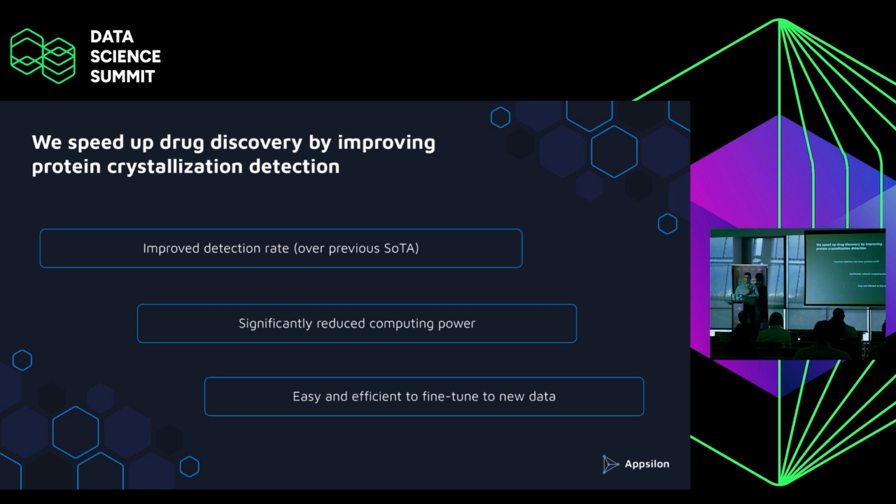One thing is that we've improved the detection rate, so basically how precisely we detect those crystals. Second is a significant improvement in the computational resources needed for that. And the last point, which I personally find the most interesting, and which maybe can also translate to many of your problems that you might be facing, is how to easily and efficiently fine-tune to new data. So basically, how to improve the generalization of the model.